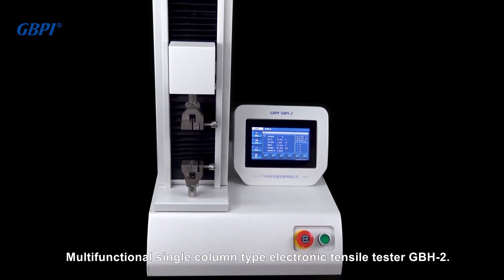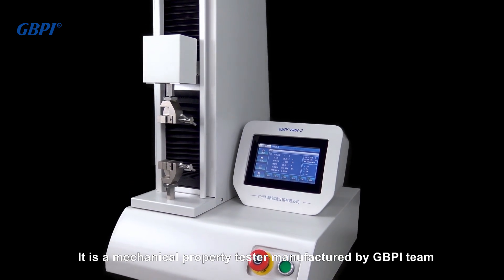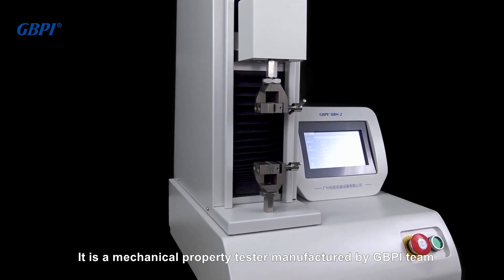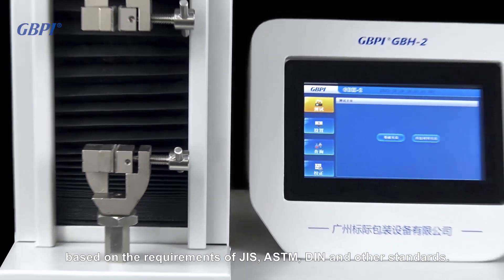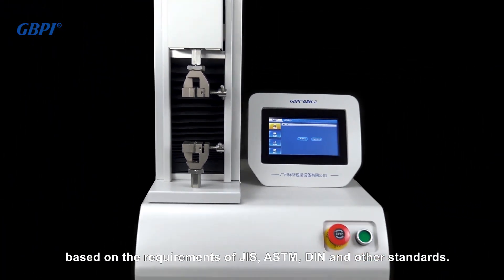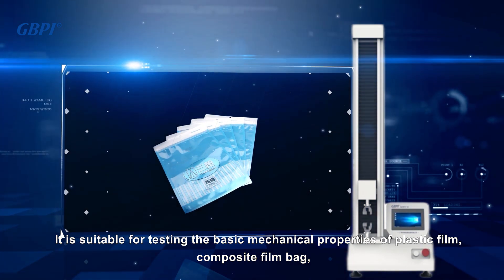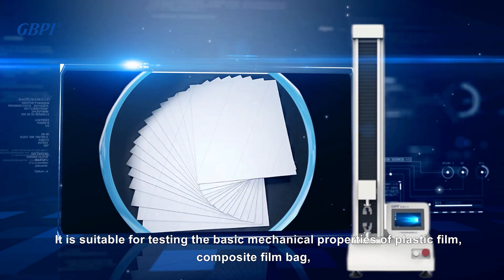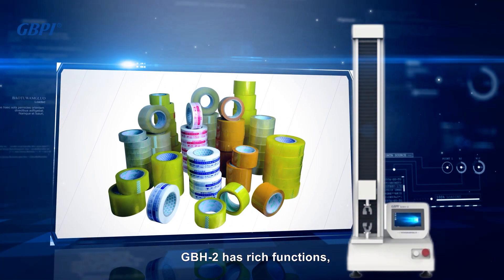The GBH2 is a Multifunctional Single-Column Type Electronic Tensile Tester manufactured by GBPI, based on the requirements of JIS, ASTM, DIN and other standards. It is suitable for testing the basic mechanical properties of plastic film, composite film bag, paper, medical adhesive pressure sensitive tape and other products.